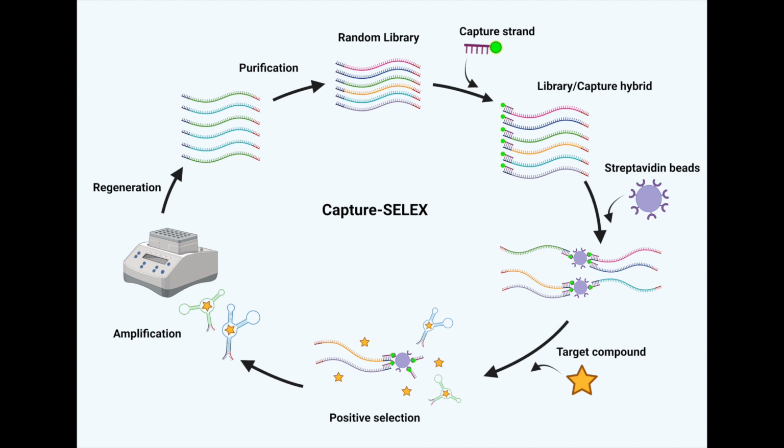After cleanup, congrats! You've completed a single round of SELEX. Now we have a pool of DNA with much better potential aptamers, as all of these strands of DNA have demonstrated at least some affinity for our target molecule. This then becomes the starting pool for the next round of SELEX. This is a diagram of the whole process, and in order to develop an aptamer, you have to run through this process 10 to 20 times.